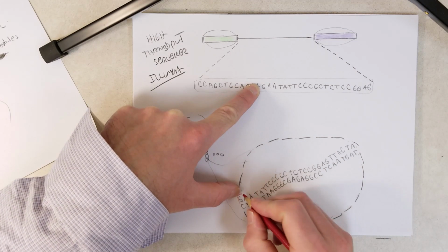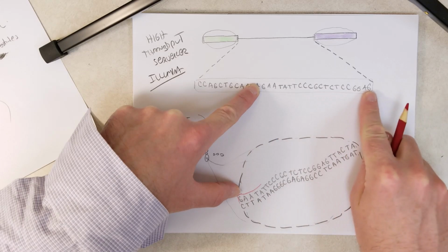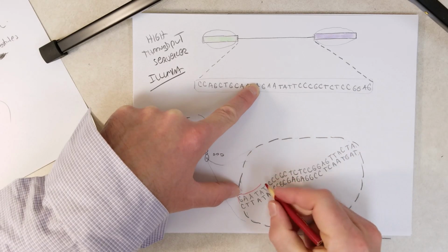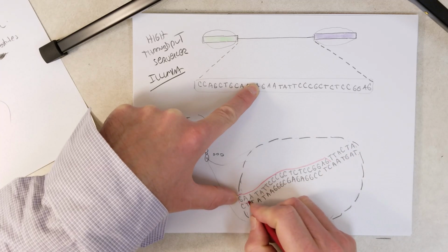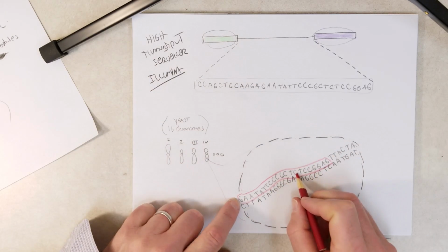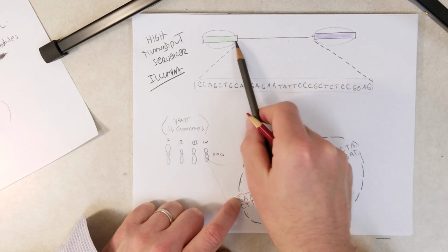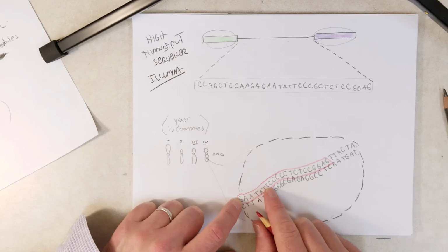So we're looking in the sequence of this chromosome, and we're going to go all the way to GGAG. Okay, so here is the sequence in the yeast genome that matches the sequence between these 2 adapters. So what does that mean?